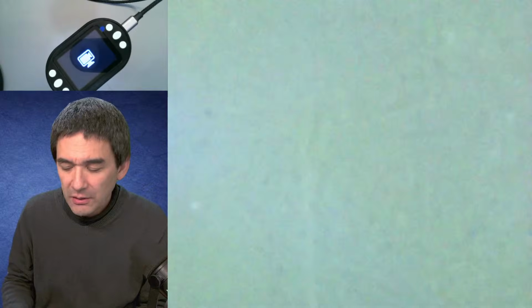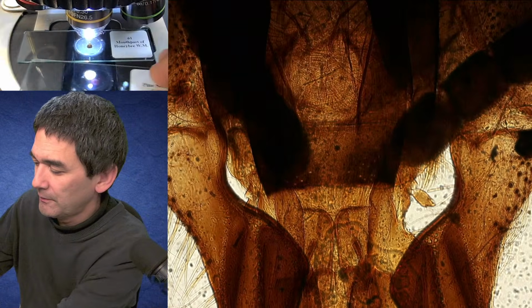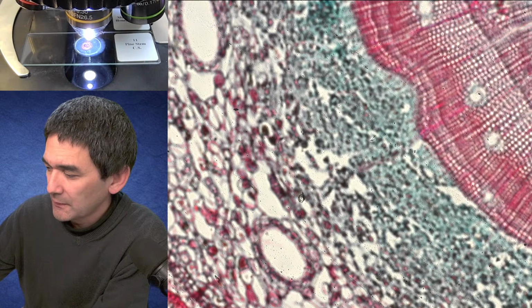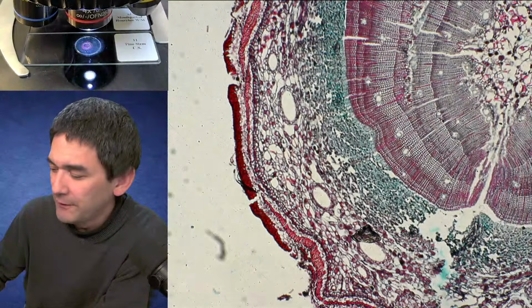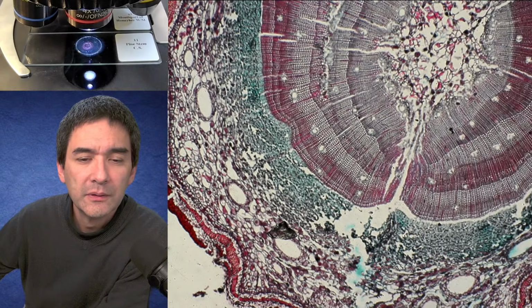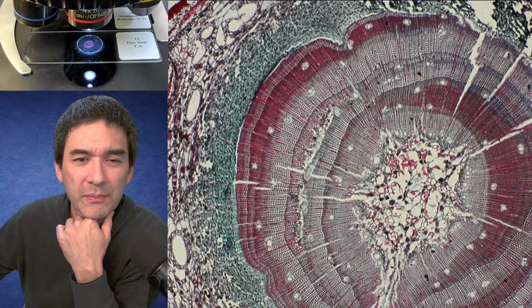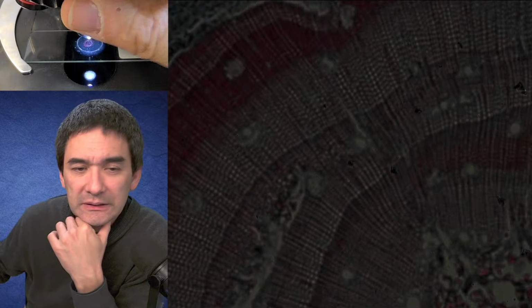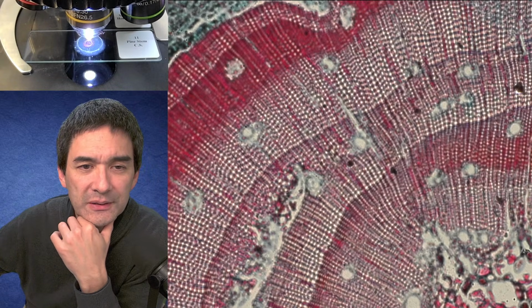So let's have a look again at the other one here. This is the one that we just had a look at. Let me go down with the magnification. I'm staying now with bright field, in case you wonder. The details with the real, under quotation marks, microscopes are really much more, I don't know. It's, of course, no comparison.